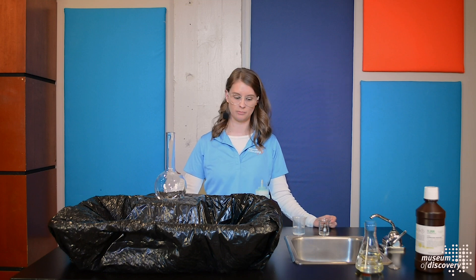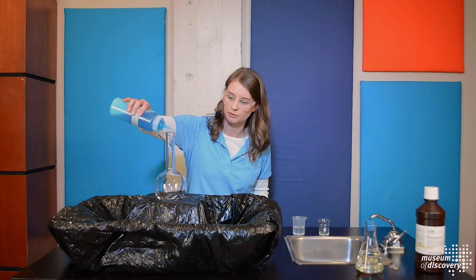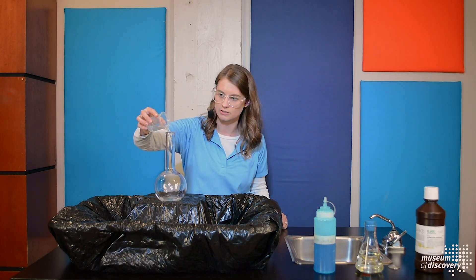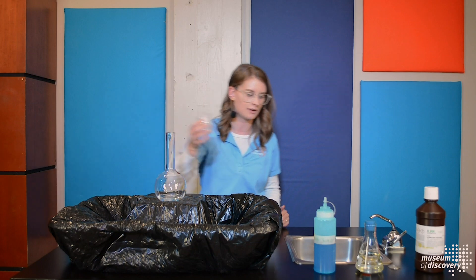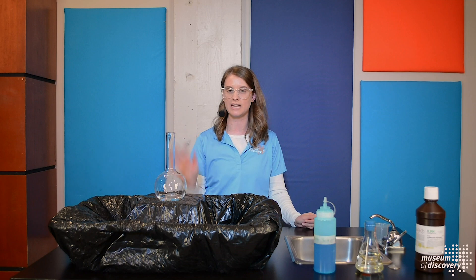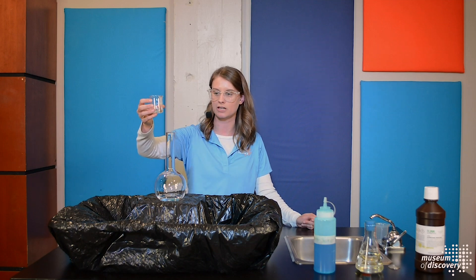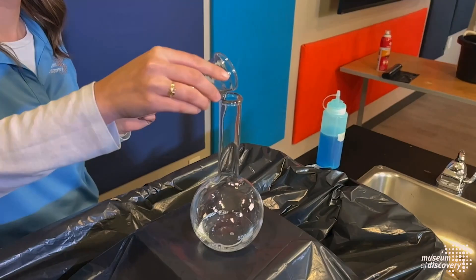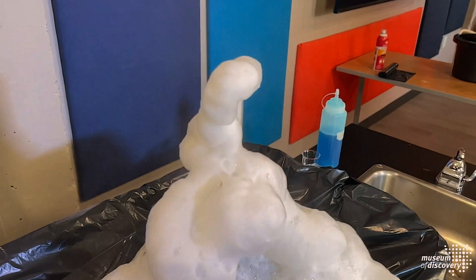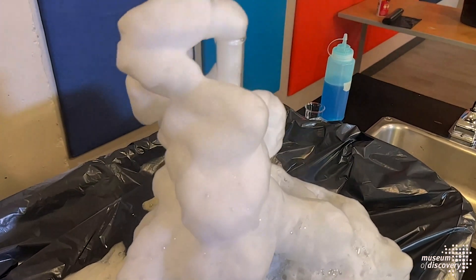Let's talk about elephant toothpaste. This is a reaction between hydrogen peroxide and sodium iodide, and then we add a little bit of dish soap. We're going to add our hydrogen peroxide to our dish soap. Even though you can't see it, there's already a reaction occurring — just by adding the hydrogen peroxide to air, it already starts to release oxygen. To speed up this process, we add our catalyst, sodium iodide. A catalyst, in any chemistry experiment, is something that speeds up the process. And watch what happens! There's steam coming off the foam we created, and the reaction between hydrogen peroxide and sodium iodide is exothermic — which means it releases heat.